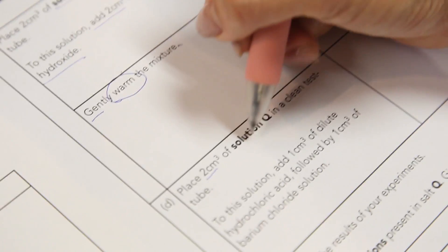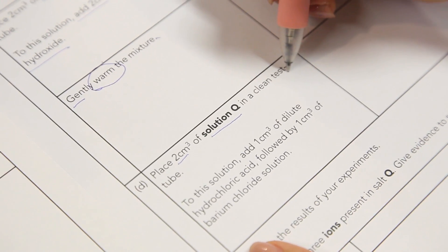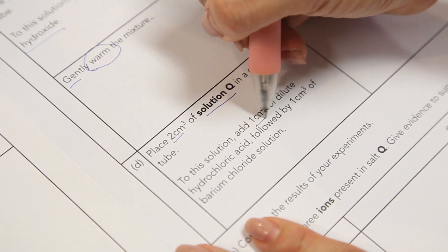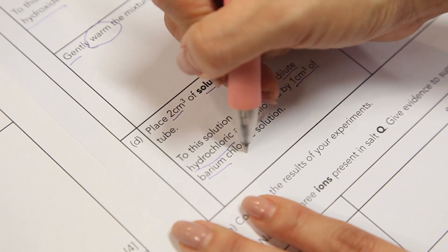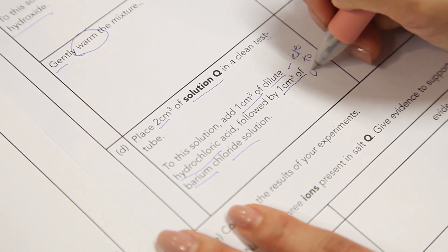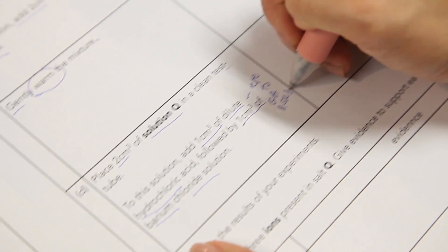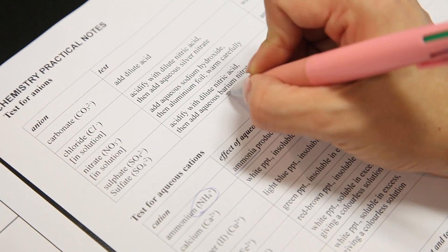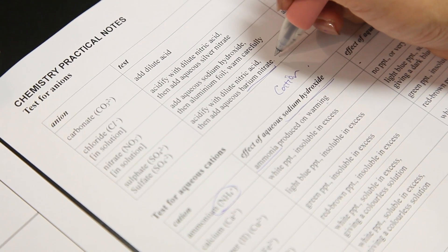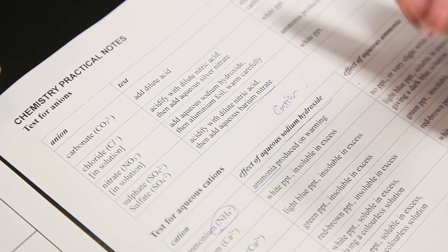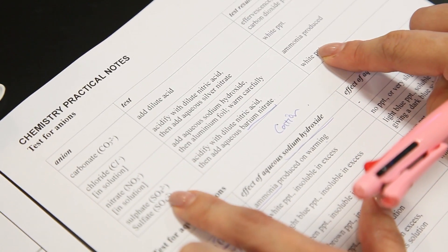To another 2 cm3 of Solution Q in a test tube, add 1 cm3 of dilute hydrochloric acid followed by 1 cm3 of barium chloride. Also refer to QA notes. Over at this portion, they use barium nitrate. Sometimes we use barium nitrate. Sometimes we use barium chloride. But the observation is to test for the sulfate.